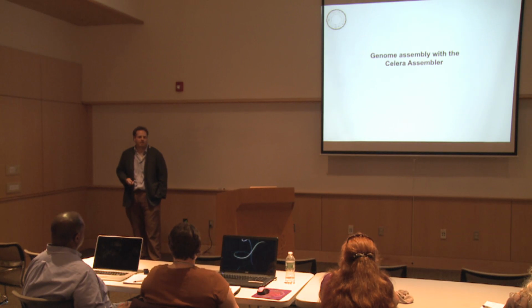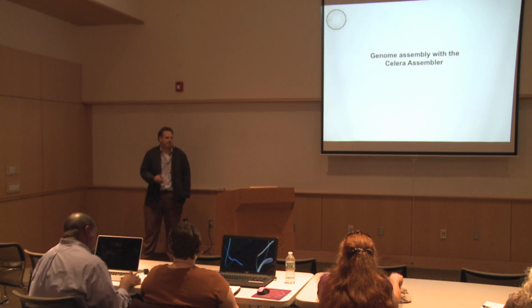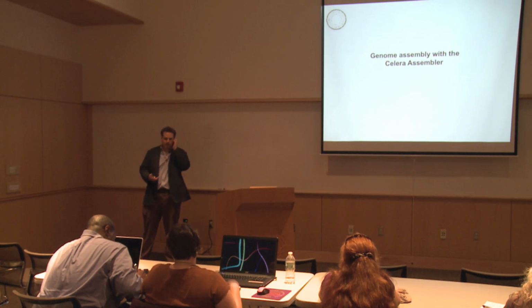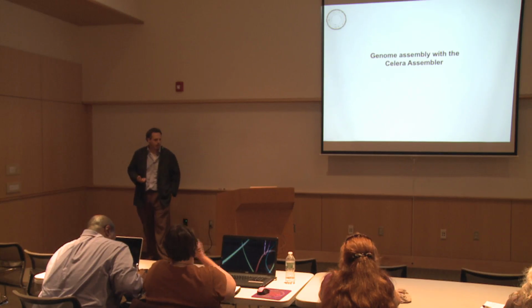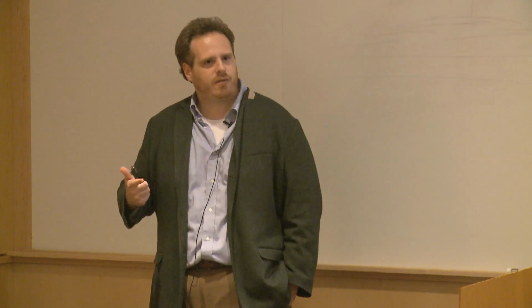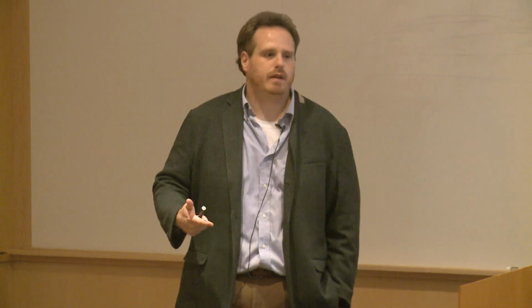The one I recommend is called ALLPATHS, produced by the Broad. They've done a great job making it relatively, actually very easy to run and operate. You generally get a very good assembly as output. I don't know if there are iPlant users in the room, but we've installed it in the Discovery Environment, so it's relatively straightforward to run Illumina-only assemblies in there.